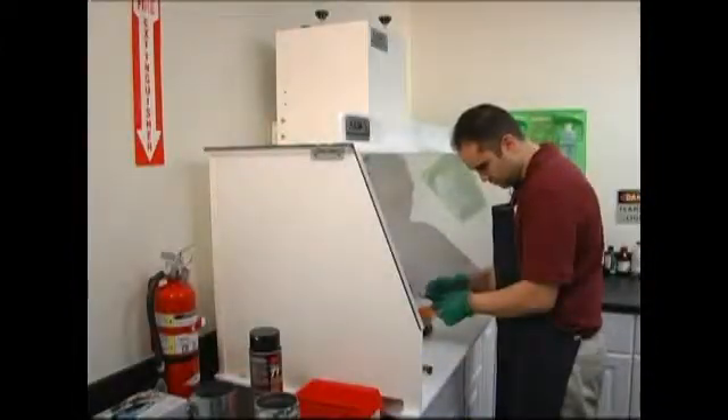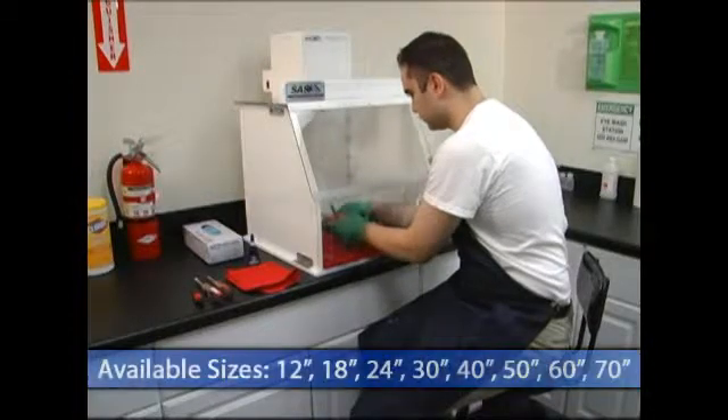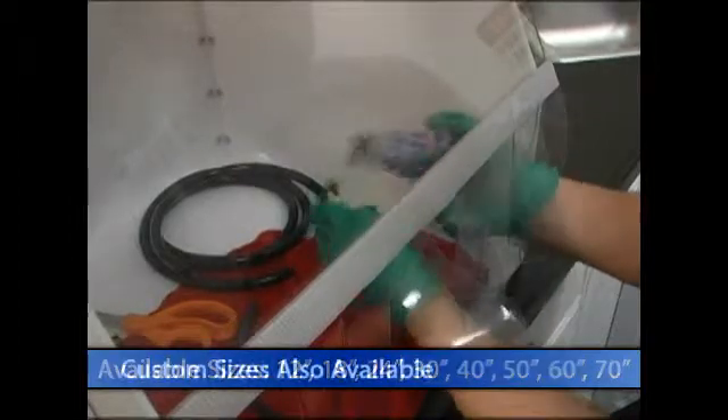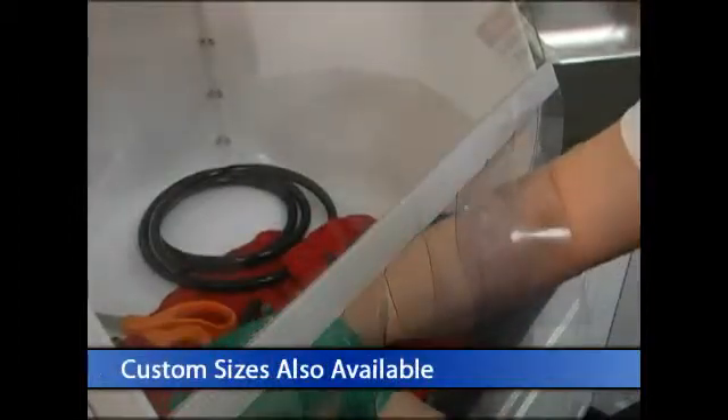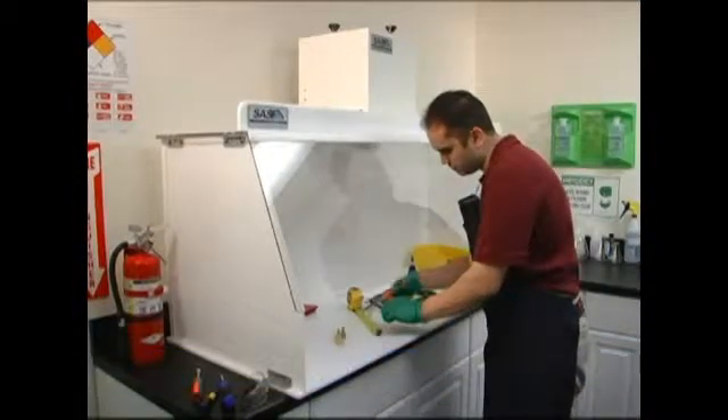Ductless fume hoods typically offer the most containment for epoxy applications. Hoods are available in a variety of standard sizes, from 12 inches wide to 70 inches wide. Custom options are also available and can include modifications to hood material, hood size, custom cutouts, and much more.